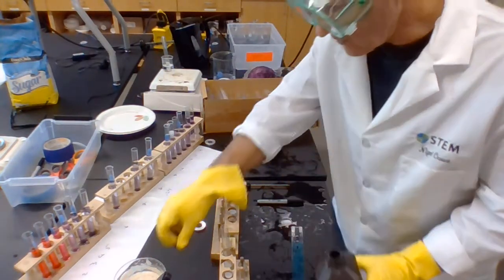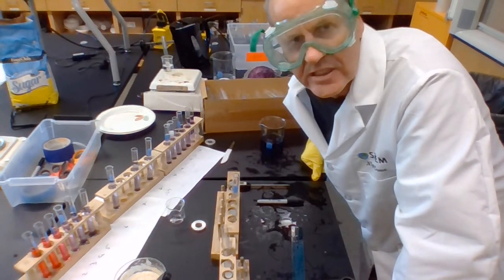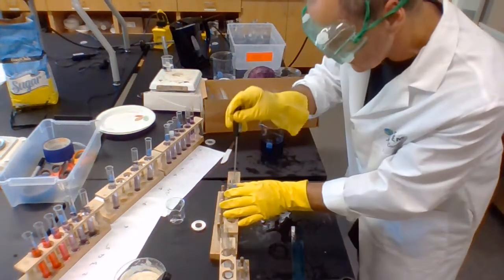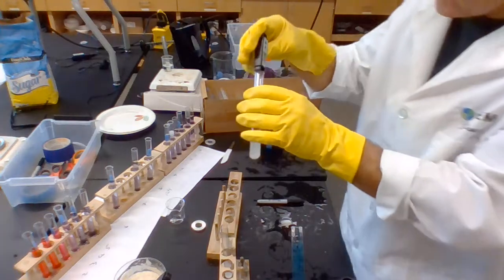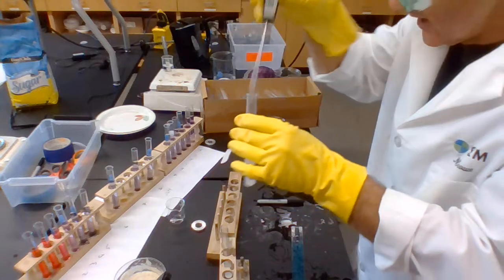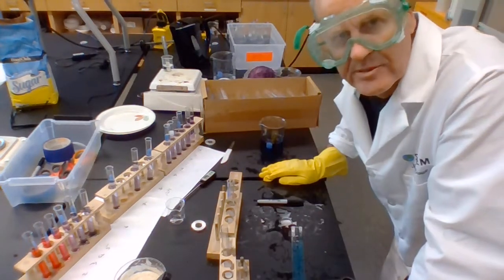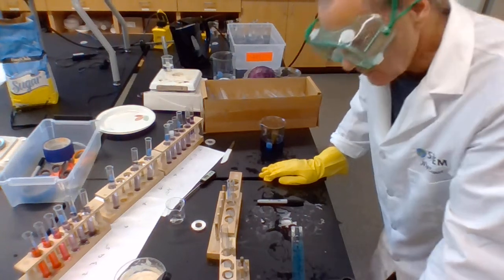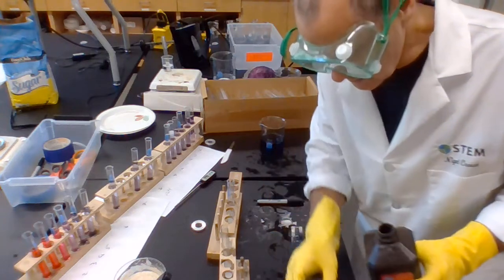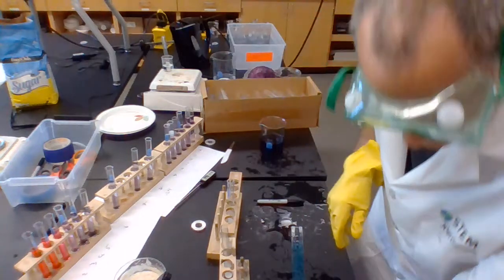So let's have a look what we've got here. Firstly, I'm going to look at the effect of temperature on the rate of the enzyme-controlled reaction. The first one I'll look at is this test tube. It has 23.6 degrees Celsius. Now, it doesn't have to be 37, 38 degrees for the optimum temperature. That tends to be the optimum temperature of enzymes in the human body. And yeasts, of course, don't tend to operate at such high temperatures as mammals like us.